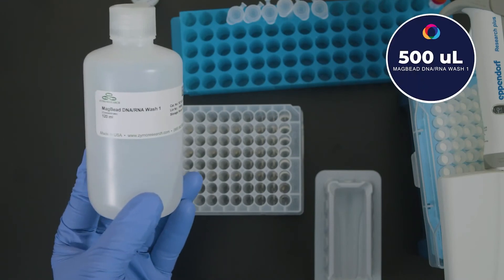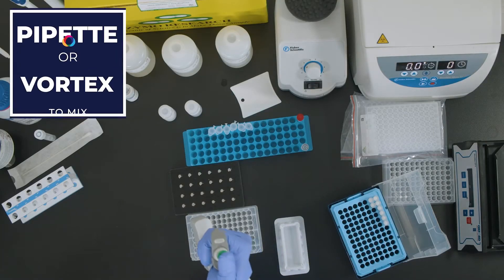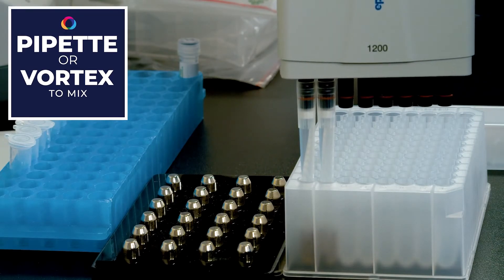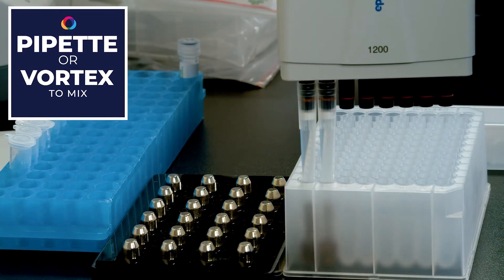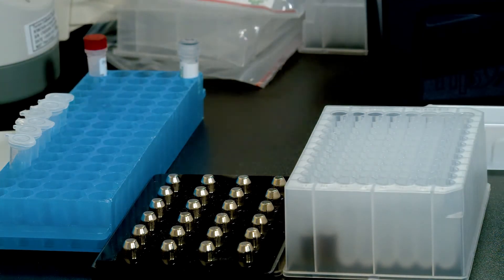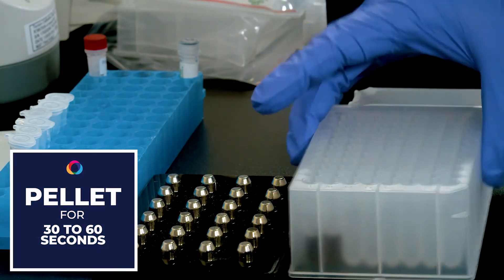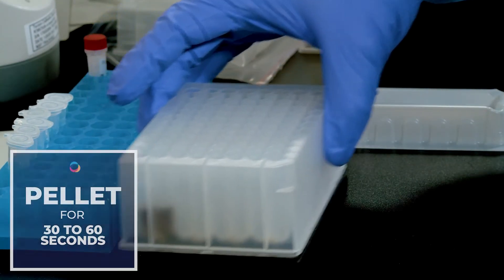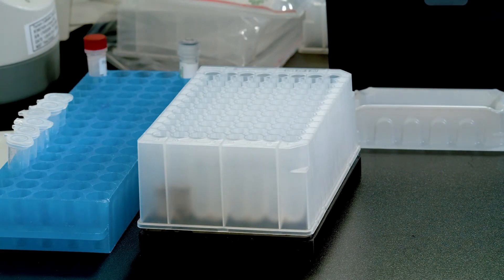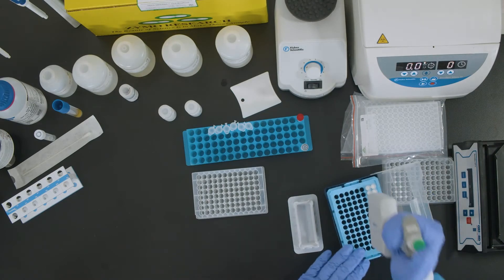Add 500 microliters of Mag Bead DNA RNA Wash 1 and pipette up and down to mix in plates, or vortex to mix in tubes. Transfer the plate or tubes to a magnetic stand and allow to sit until the beads have pelleted, approximately 30 to 60 seconds. Aspirate and discard the supernatant and retain the pellet.